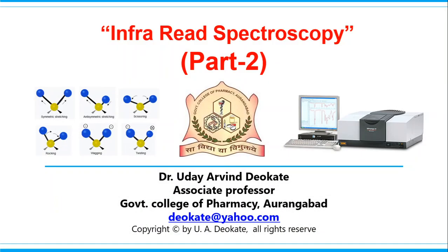Hello friend, we'll start with the second part of infrared spectroscopy. In this chapter, we are going to learn the factors affecting vibrational frequency and the applications of infrared spectroscopy.